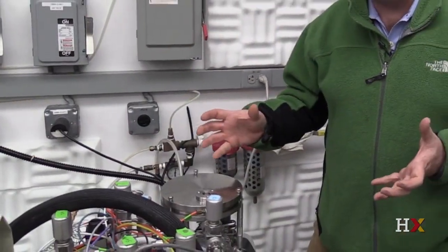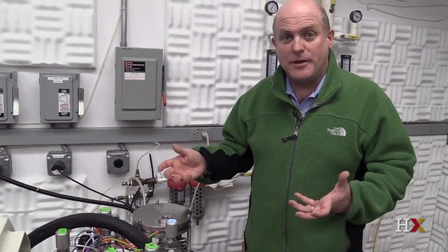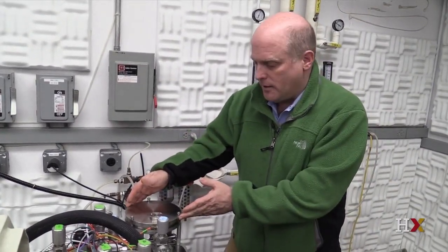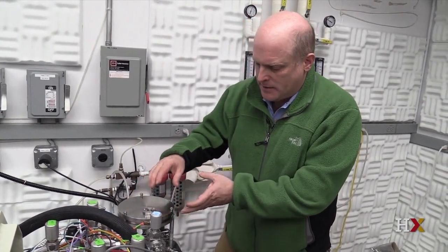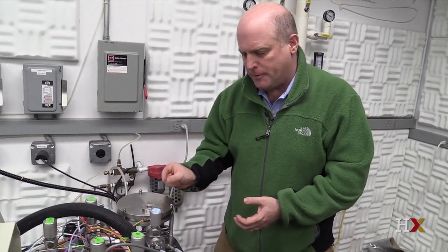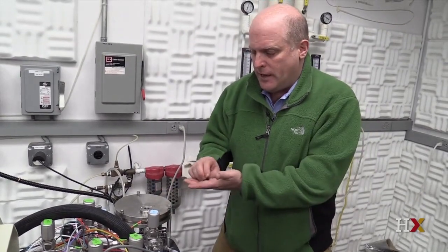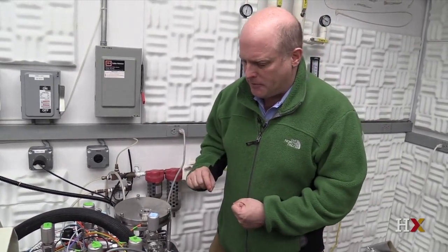Here's the mass spectrometer we use for measuring the isotopic composition of calcium carbonate we use for paleotemperature reconstruction. Now it all starts here. This is a carousel that is under vacuum because we can't let atmosphere get inside. And we load the carousel up with little capsules filled with calcium carbonate powder. This could be little foraminifera shells, or it could be tiny ground up pieces of limestone, or various other bits of calcium carbonate from geologic samples.